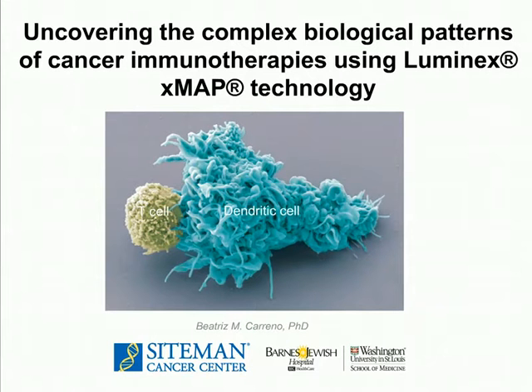I'll share with you some of the results of that study, and also how we have used a multiplex platform to characterize the vaccine and to understand the T-cell responses that the vaccine induces.